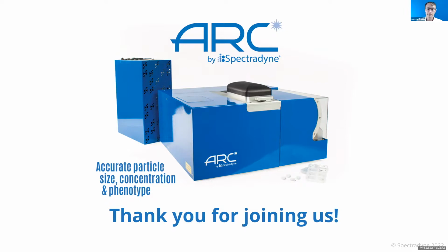Let me see. There's a question, does the ARC use the same cartridges as the NCS1? And the answer is basically yes. So they're interchangeable. So if you trade in your NCS1 for an ARC, you'll be able to keep your cartridges and use them with the next gen technology.